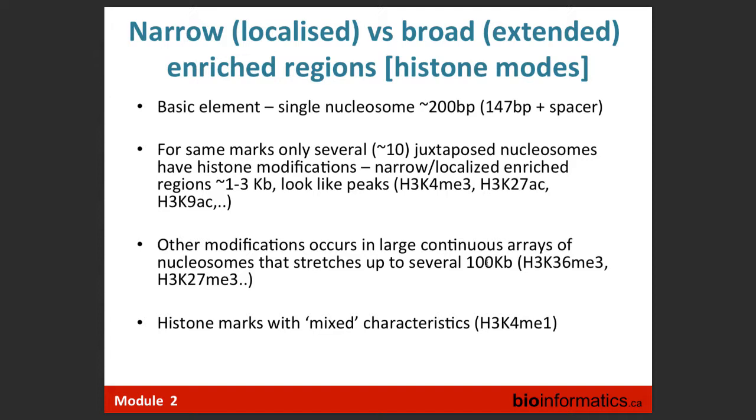Different biases that go into creating peaks in ChIP-seq, and whether there is a need to delineate them. Yes, I can. Let me think how better to do it. Let's go through the process, and I will be mentioning some biases along the way. Biases are very, very important.